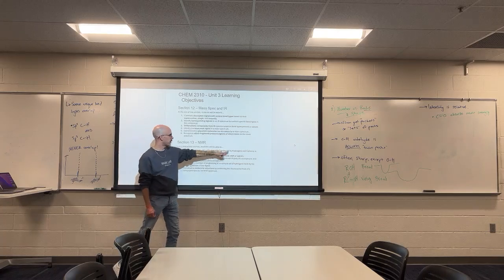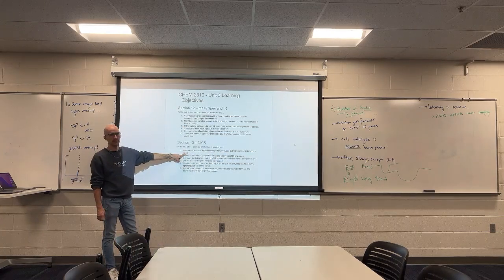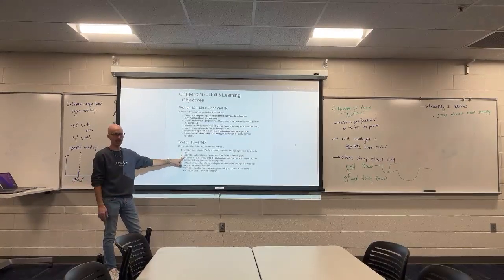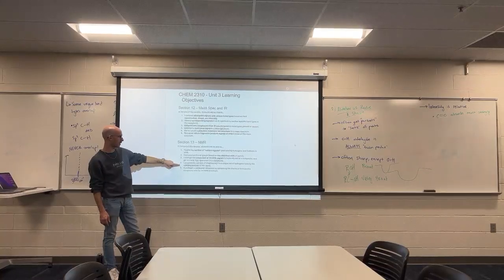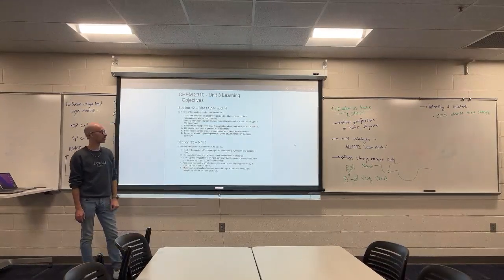By the way, I did put carbon NMR in the learning objectives. But you guys saw how easy that was, to just count how many unique carbons there are. I don't think you'll see problems like that, but I'm also planning on making changes as I go forward. And I think counting the number of unique carbons is not hard, so I think that was easy enough to keep in there. Splitting pattern and construct a molecular structure.